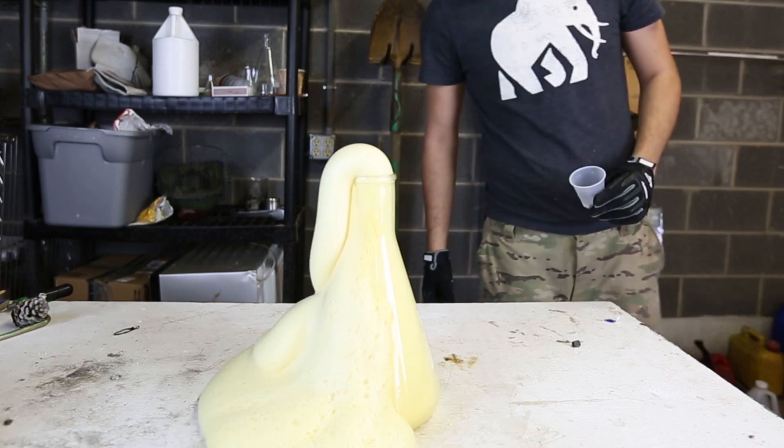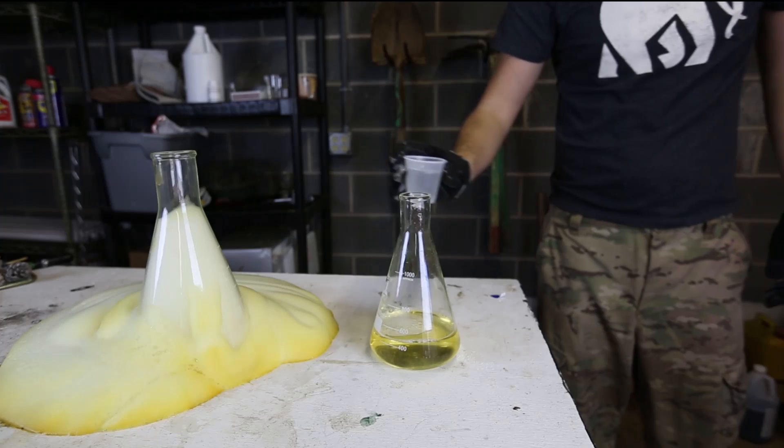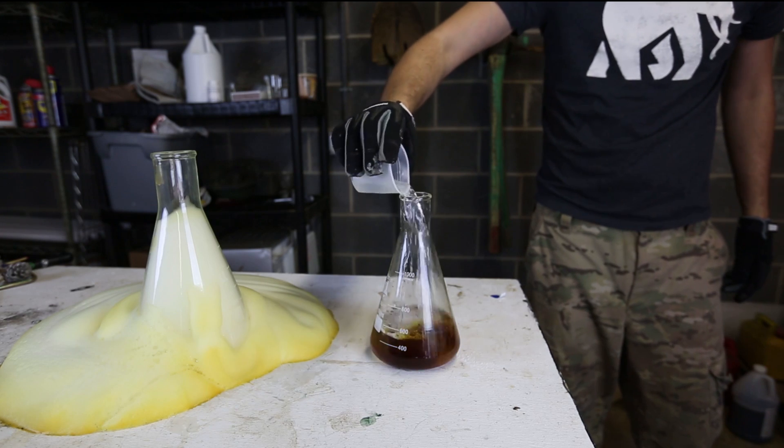That's a lot of foam! What do you guys think? We're going to try this again in a little smaller beaker. Got potassium iodide solution and hydrogen peroxide solution — pour it together.